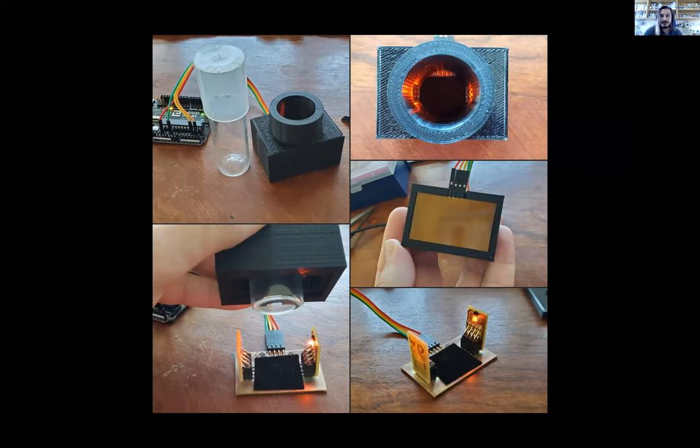So you get an overnight curve, and instead of taking a sample physically out of the tube, you read directly through the tube, which is super handy, because then you don't reduce volume, and the entire culture gets considered in your growth curve, right? You're not slowly reducing volumes. And so the smaller the volume that you start with, the larger the drops, the less accurate your growth curve is going to be. So in order to accommodate for that, I'm just shining directly through and reading it.